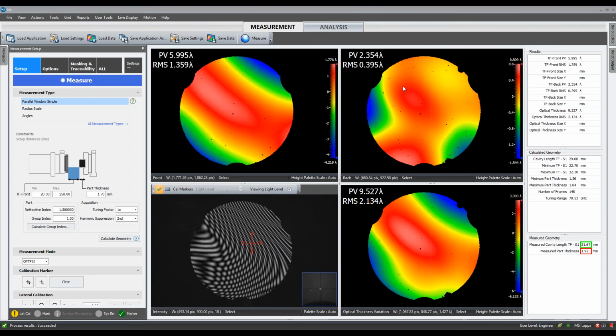There are always concerns like retrace and things like that, and it's really about the local slope. But by and large, you can do quite a lot with these new high resolution systems, especially compared to the old 640 by 480 type of stuff.